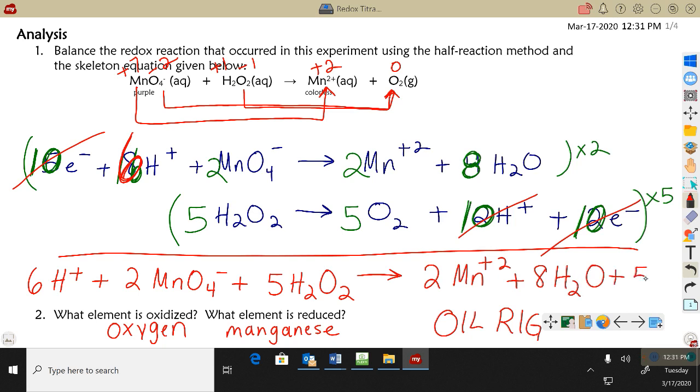and 5 oxygen. Again, you probably didn't really notice it at the time, but as you titrate, it does give off little teeny tiny bubbles. Sometimes it almost looks a little bit like 7-Up. That is the oxygen coming off of the hydrogen peroxide.